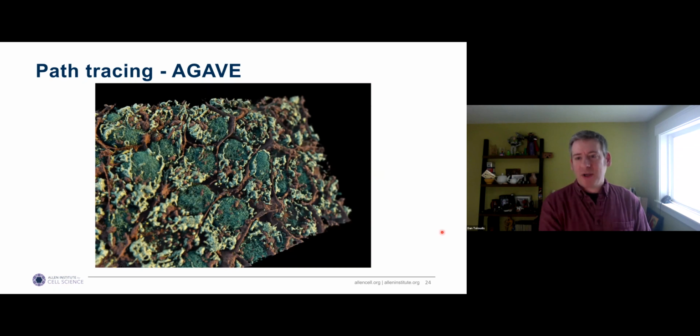Here's another capture from Agave that shows that you can apply interesting color choices. And because of the path tracing algorithm, and because it's doing ray optics, there's also a physical lens model built into the algorithm. So we can control parameters like lens aperture and focal distance. And we can create these depth of field effects where far regions and near regions are slightly blurred. They can be blurred considerably more than this, of course, but you can choose to defocus these areas if you want to, for example, force the viewer's eye to gravitate toward a certain region, or just to make it look fancy.